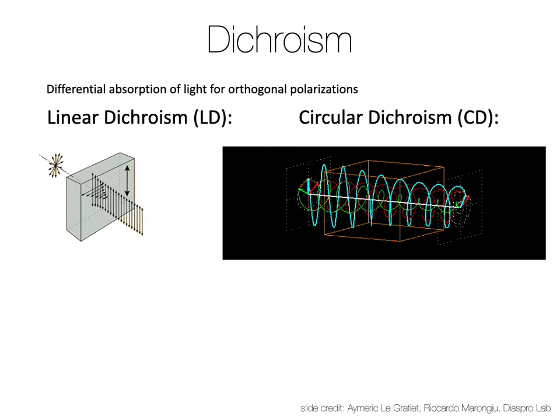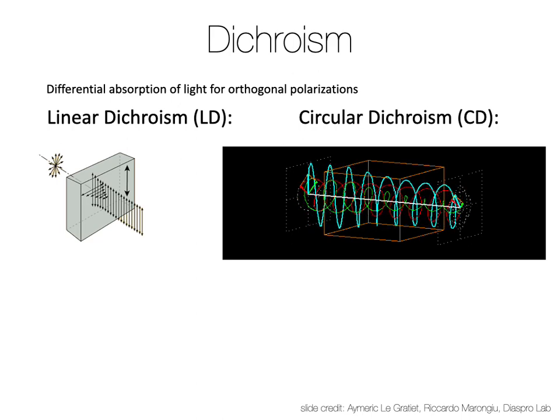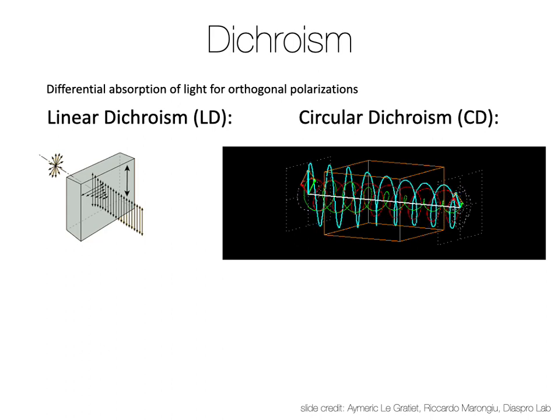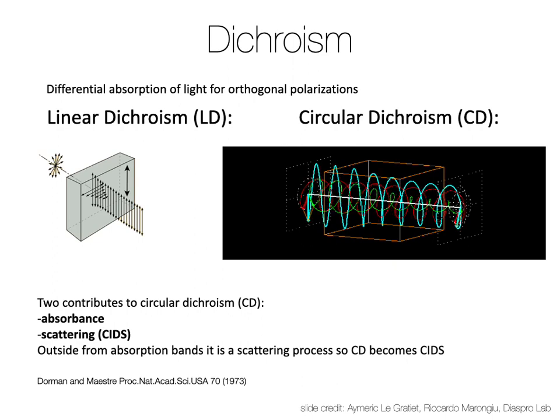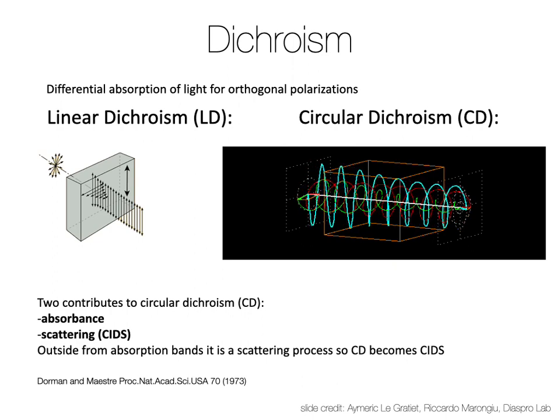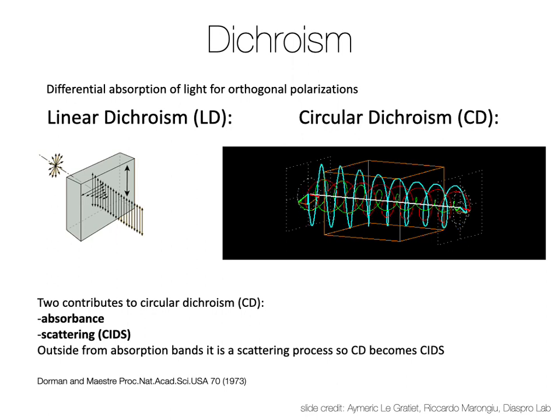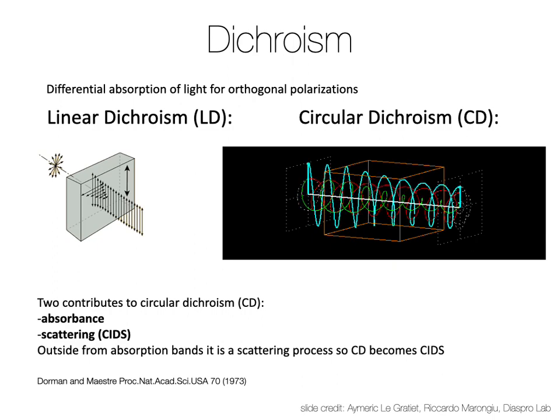In molecular biology, there was a method introduced by Ignacio Tinoco that is called circular dichroism, also linear dichroism. What does it mean? It means that if you shine light in the absorption window of your molecule, in the ultraviolet in this case, and you control polarization, you can have an output that is a function of the mutual arrangement of the molecules.